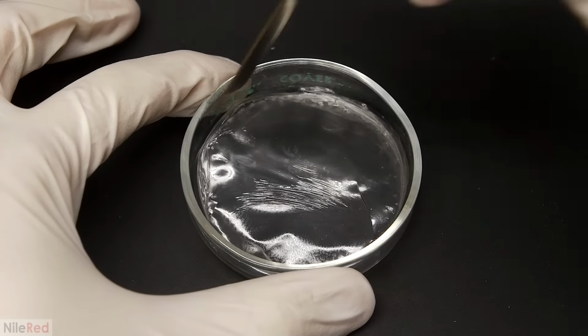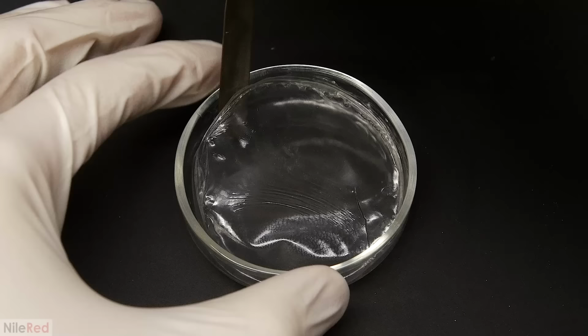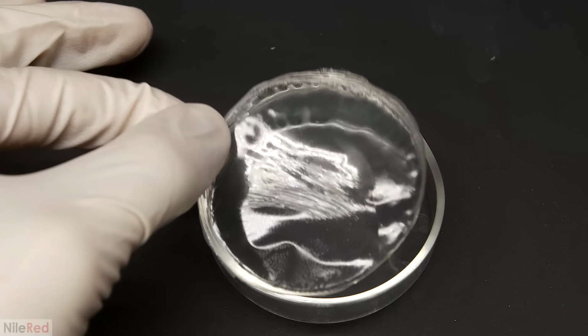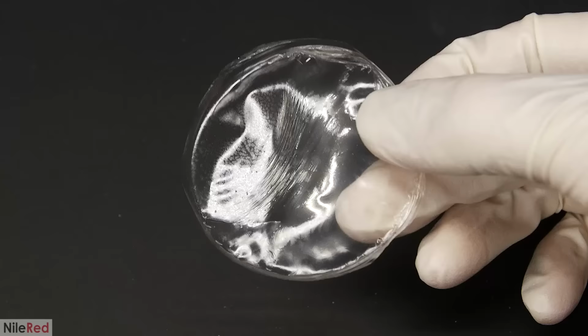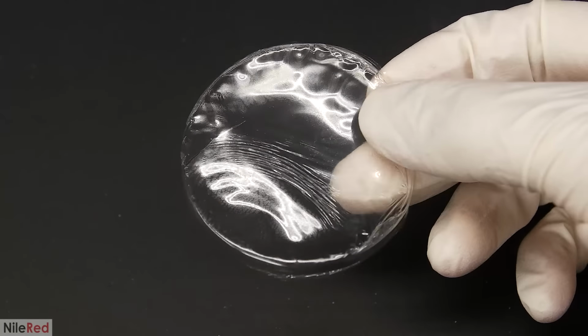I first look at the one in the dish, which turned out way better than I expected. I honestly thought it would just stick to the sides and be a complete mess, but it was extremely easy to remove. It's definitely not the most beautiful piece of plastic, but I was still pretty impressed by it, considering it did come from filter paper.